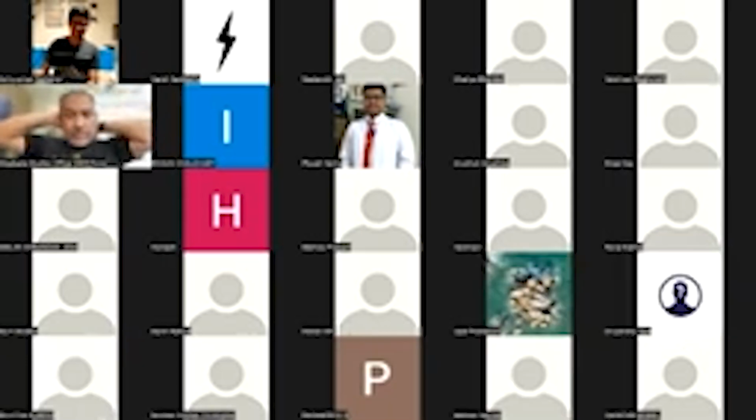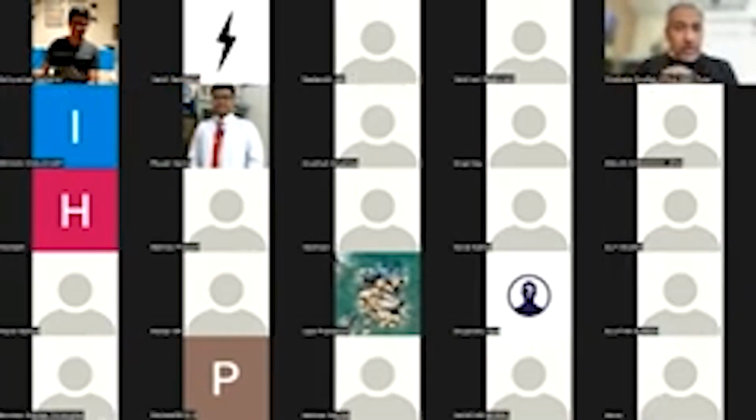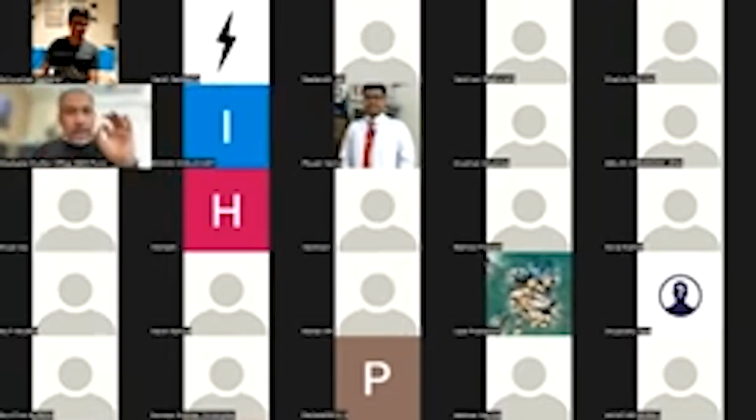Okay, sir, I wanted to know about the different contrasts of fluorescence images that you showed. What is their significance? Like, do we use them to see different properties of what we see, or is there something different? Good question. Right. So you can do both. You can use fluorescence microscopy to largely pinpoint a particular thing inside the cell. It could be, for example, a dye called DAPI that labels the entire nucleus, because it binds nucleic acid, and it will fluoresce very brightly in the nucleus, and this can be used to visualize the nucleus.